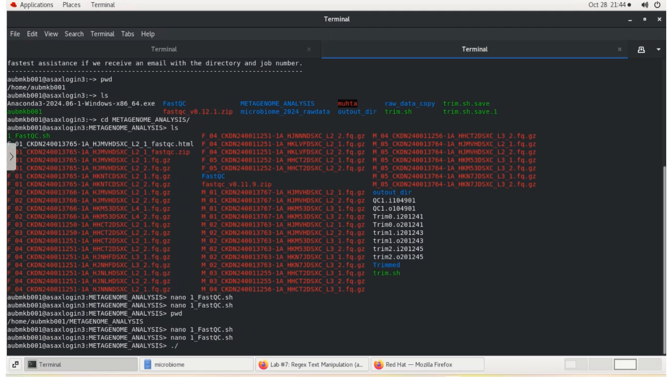So for running the script, I'll put dot slash and my script, and then I can press enter and run the script. As I'm already in the directory, I don't need to put a file because it's gonna already read the files it has in here with this file extension, that is fq.gz. As I've already run it, because it takes some time to run, I have got this output file called FASTQC.html that I need to read the output.